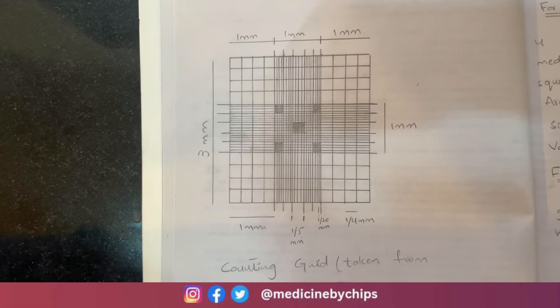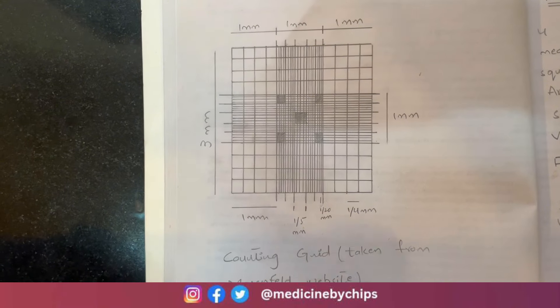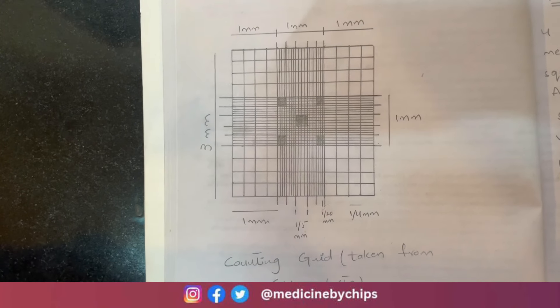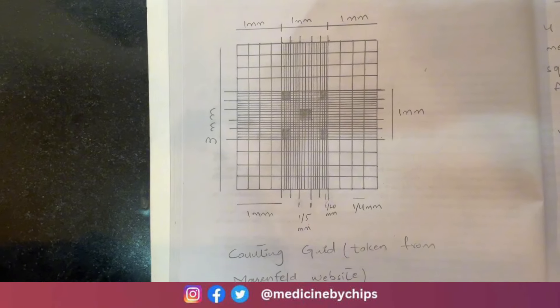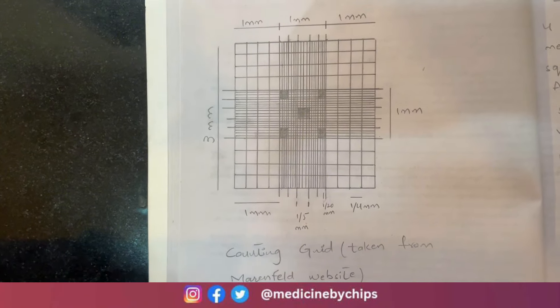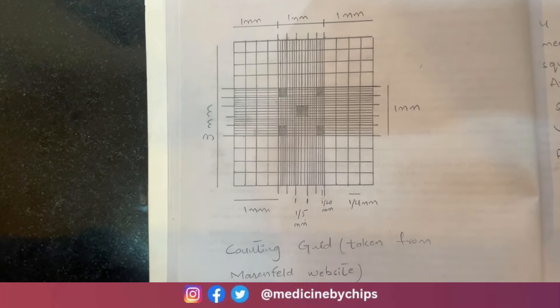This is the view you will get in the light microscope when you view the Neubaur's chamber at 10x. We have a group of smaller squares and a group of bigger squares.